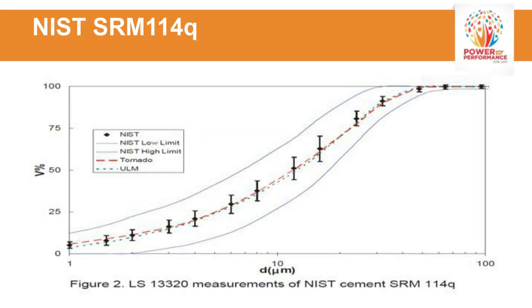And then last but not least, when analyzing real cement, utilizing the NIST SRM 114Q, the NIST values for the standard are the diamond-shaped positions, with the blue lines being the range you have to be within. This standard is for laser diffraction instruments, and one has to be within the blue lines to be acceptable.